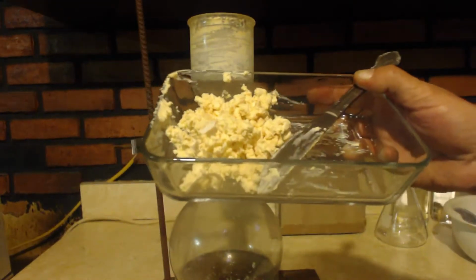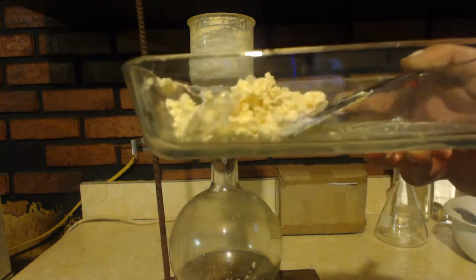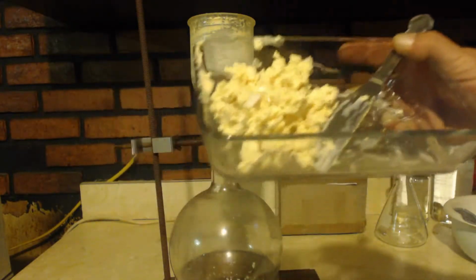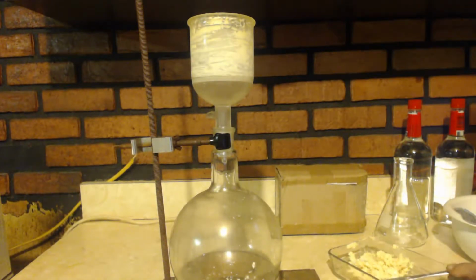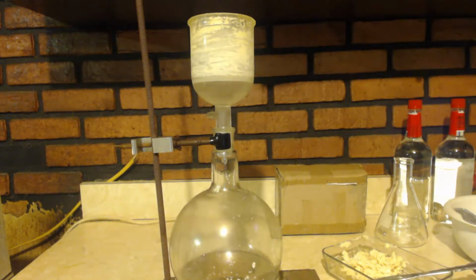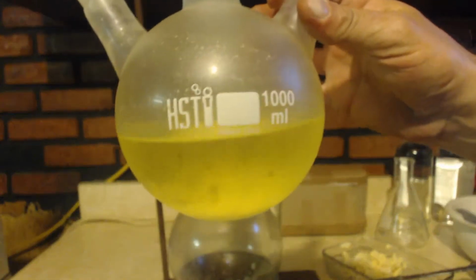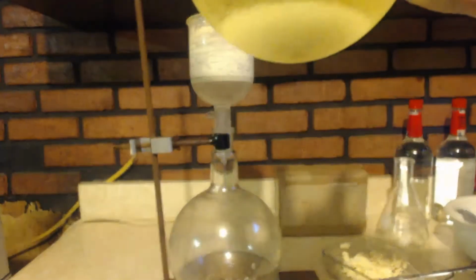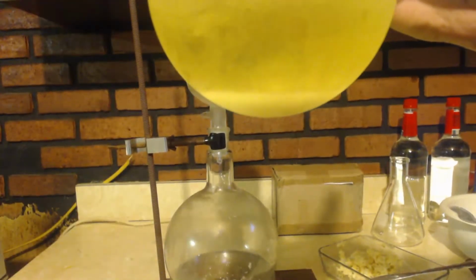Alright, so after all that time, I've filtered it out. You can see how much is there. It's a pretty good bit. Then I washed it with 500 milliliters of water that you can see right here. Now I put that in the freezer. You can see there's some precip in it.